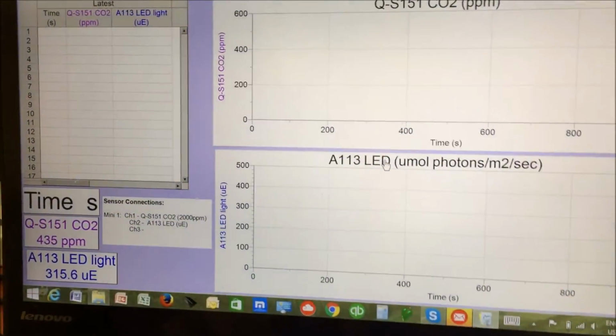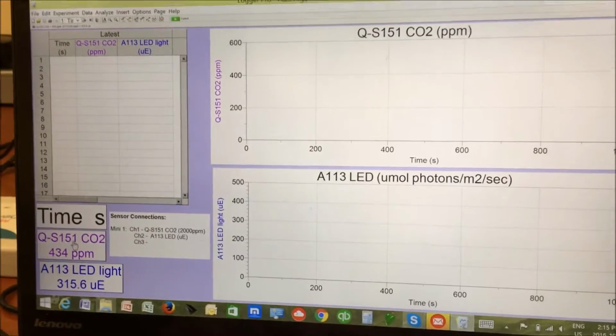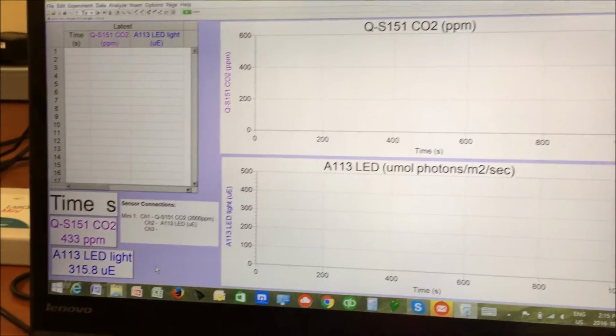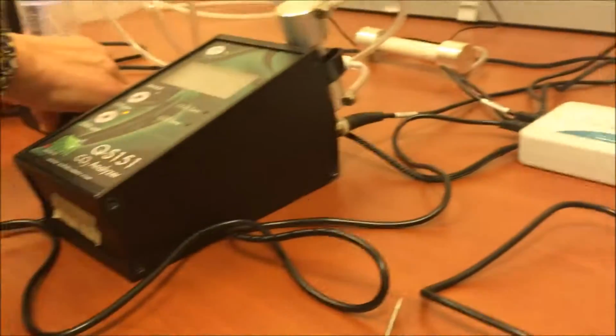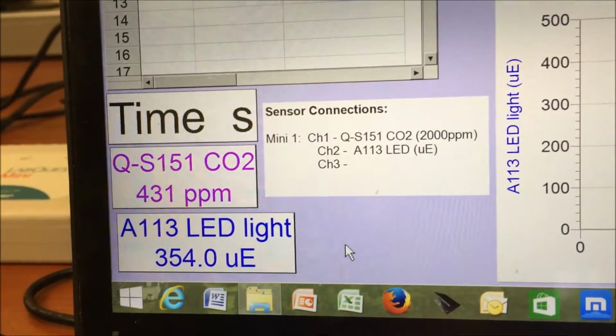Okay, so the software is now started. The data from the CO2 analyzer will be displayed in this meter, and from the LED light source in this meter. If you keep looking at the output here, if I decrease the light coming through, you can see the level is going down. If you increase it, the level is going up.